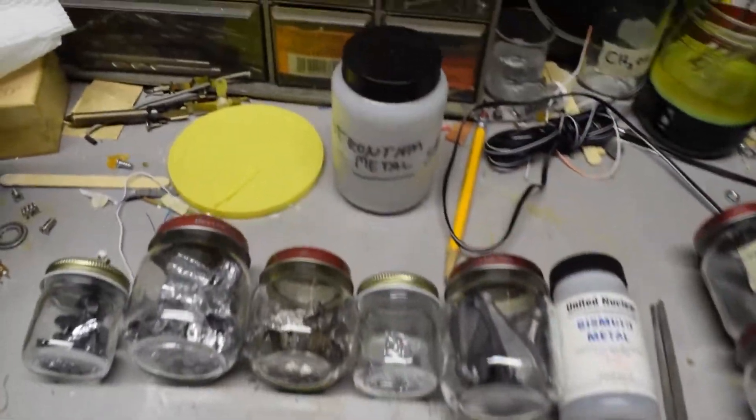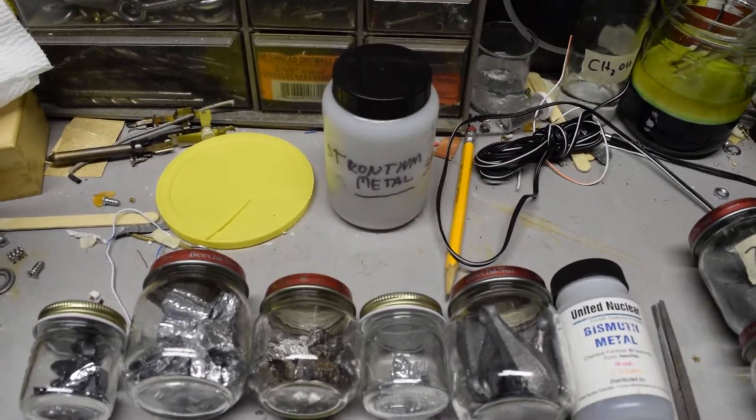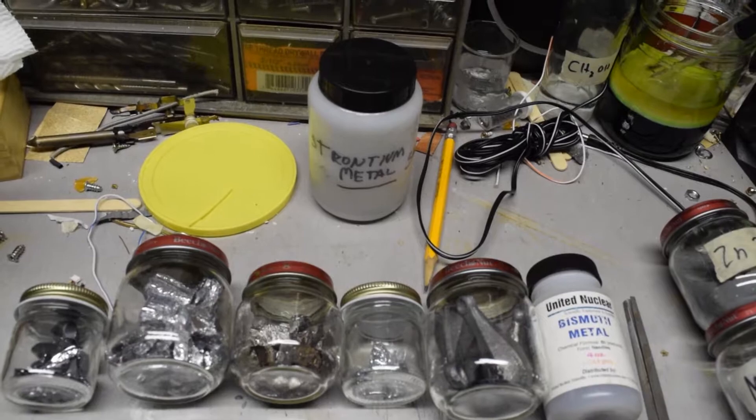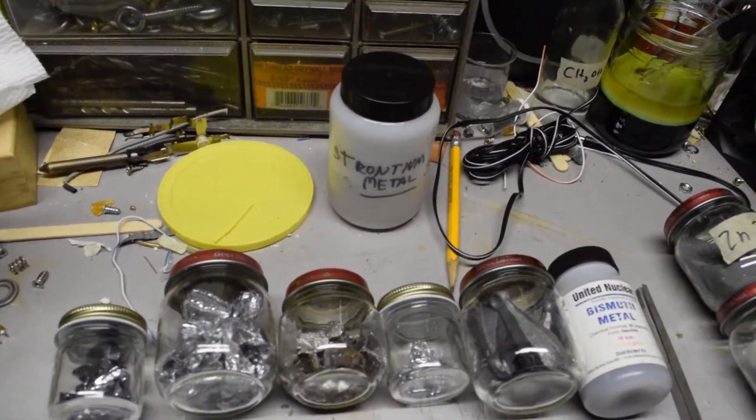I also have strontium metal, which I cannot powder because it's too soft and too reactive. So I'm just going to burn a piece without it being powdered, just burn a lump of it since it's pretty flammable.